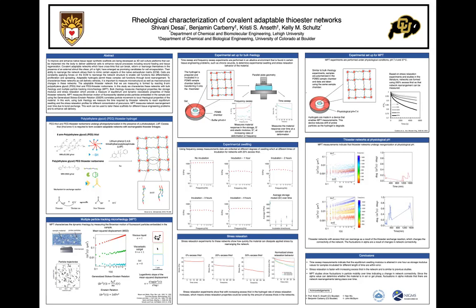We use bulk rheology to measure equilibrium swelling and to measure stress relaxation properties of the material. We use MPT to understand how the microstructural changes take place in the material over time.